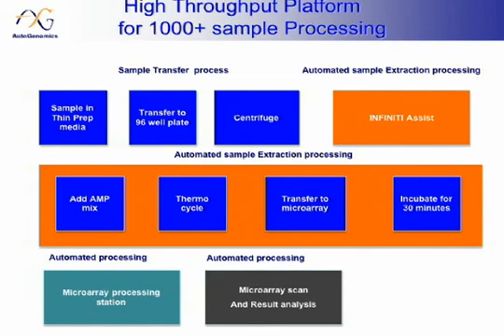Okay. Now, in order to achieve the test, first of all, I want to assure you that automation doesn't happen overnight. It always takes steps, and we build one on top of the other in order to achieve the ultimate goal. So initially, we divided the process into 3 different steps. The first step was the transfer of samples coming in, and then centrifuge and getting ready for processing. At the present time, we use the assist to follow the sample from the centrifuge time all the way till the incubation takes place. Okay.